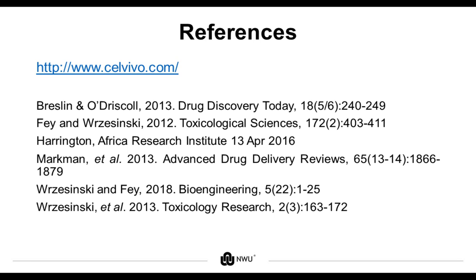Given the fact that this culturing system is an irrigated system, there is continuous flow of the media and nutrients around the spheroid. And this results in a smaller diffusion depletion zone around your spheroid in comparison to other static or passive systems. But there are previous studies that have shown that spheroids cultured in rotating bioreactors have sufficient oxygen diffusion throughout the spheroid, even to the core.